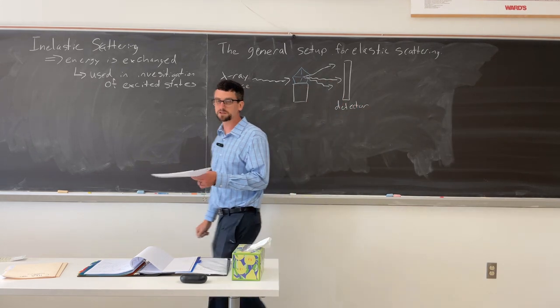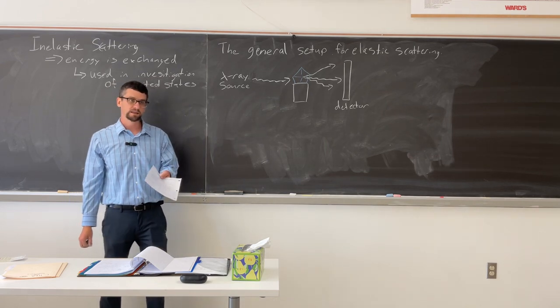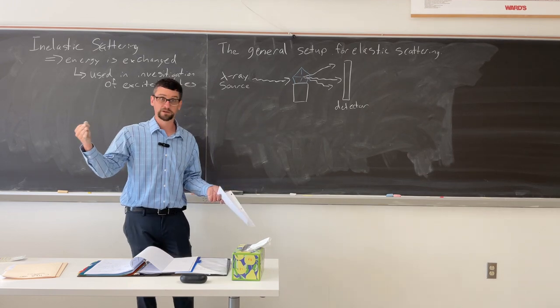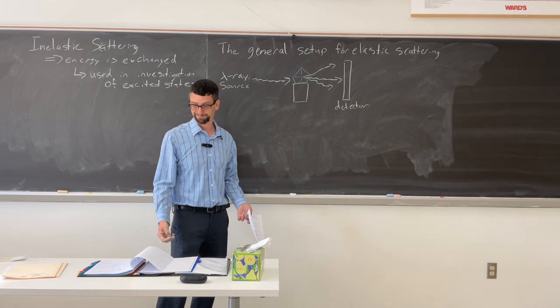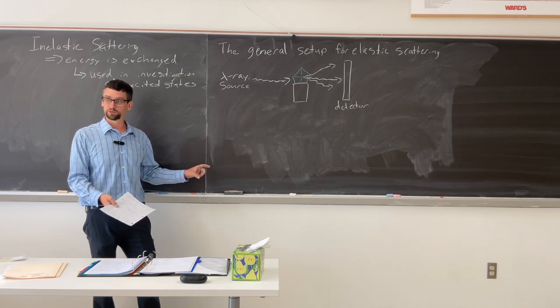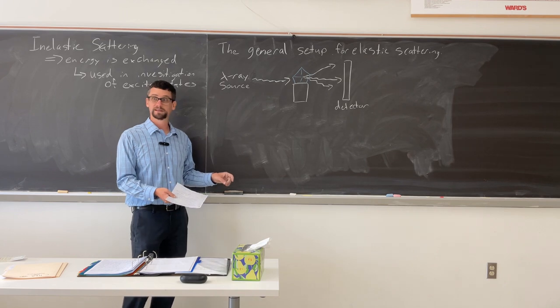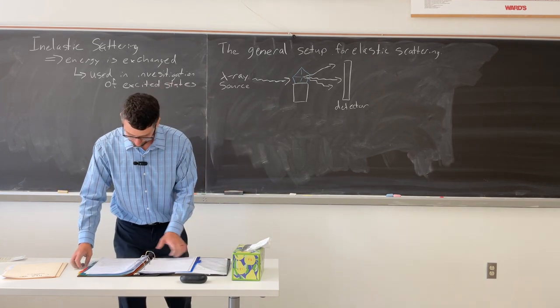In the 70s, this was literally film. And when they were studying things in like the 1900s, actually up until the 70s, it was all film. Like, that's what it was. I mean, like physical Polaroid type film. Like it was pictures. And they had to use these pictures to build it up.